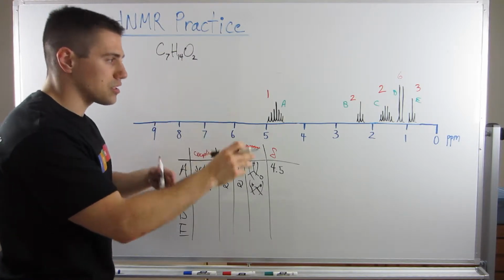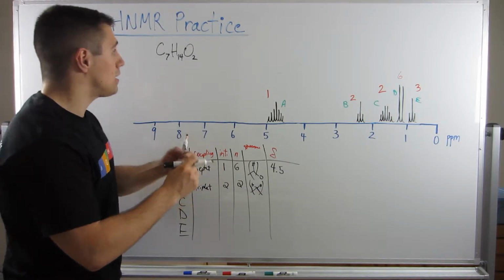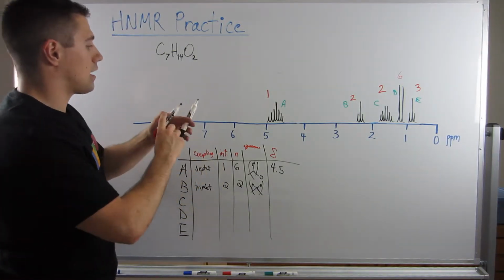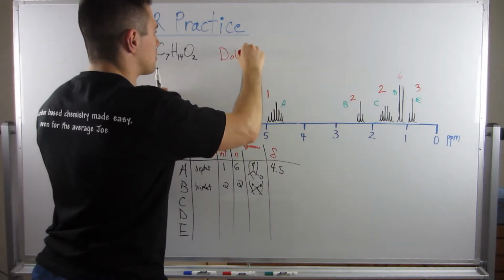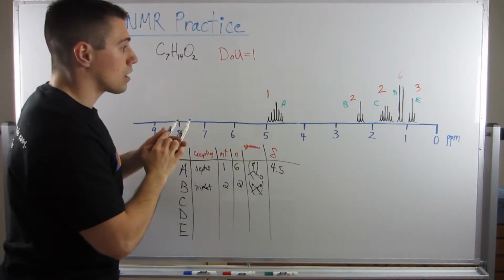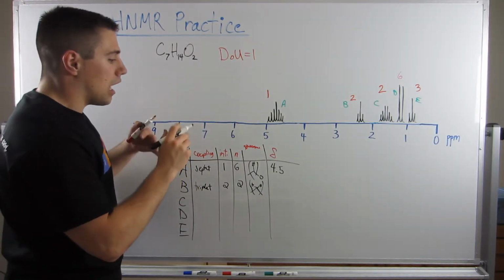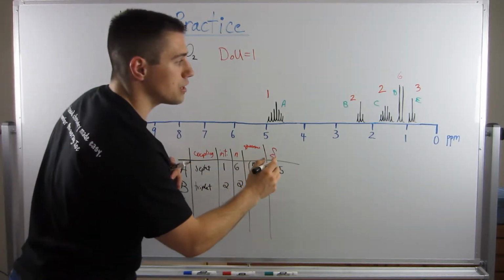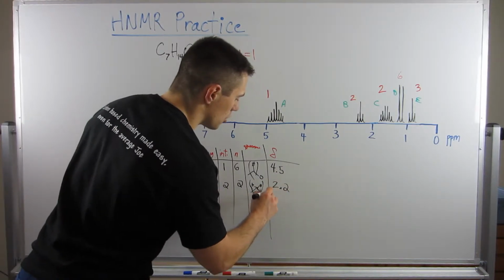So if you were to, again, look at your chemical shift chart, and due to the fact, sorry, I had to do a little rearranging and erasing, but we do have 1 degree of unsaturation, we have a little bit to play with. And what would match up super well with this chemical shift of about 2.2 is a carbonyl next door. So let's come back to this.